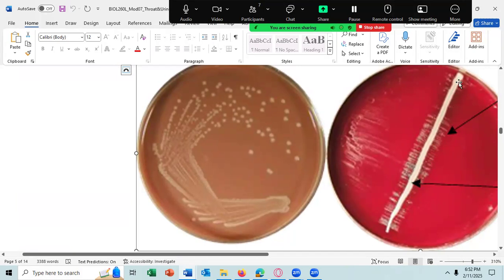The reason being is Staphylococcus aureus, which you can kind of see the streak right there in the center of this, that's the Staphylococcus aureus growing. And then the clear region is the beta hemolysis. So most of this streak is actually beta hemolysis where the blood has been lysed. And then the X and the V factor can diffuse out of the lysed blood here up until about there on the plate. And then Haemophilus influenzae can grow in this region of the plate.